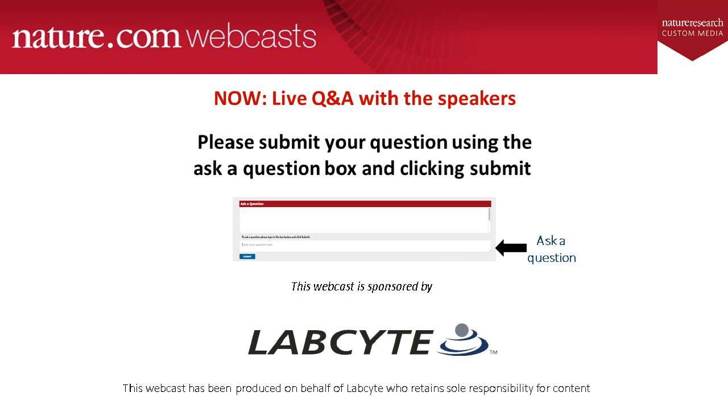And so potentially it'd be good to use this plate for 3 months or 6 months, depending on the throughput of the lab. And then you should be pretty safe with the amount of liquid there, because 50 nanoliters in a 60 microliter well is very little. So you'll be able to transfer many times out of that. And then as far as the contamination question goes, we've done qPCR studies where we transfer into one well and leave the surrounding wells open, and we don't see any transfer contamination. And those are available on the Labcyte website.